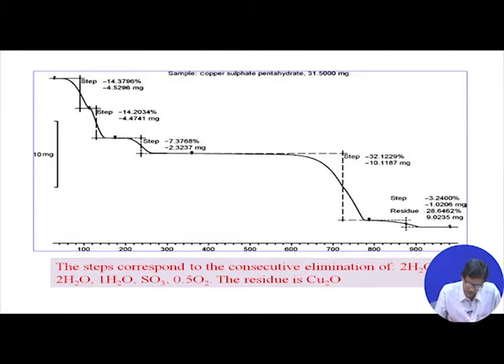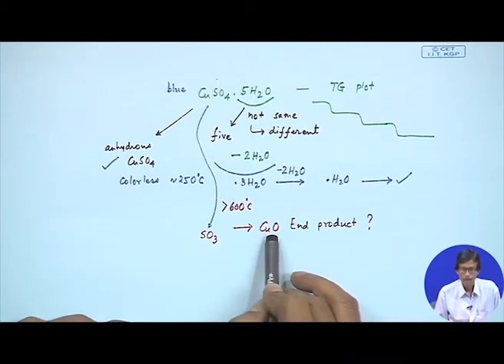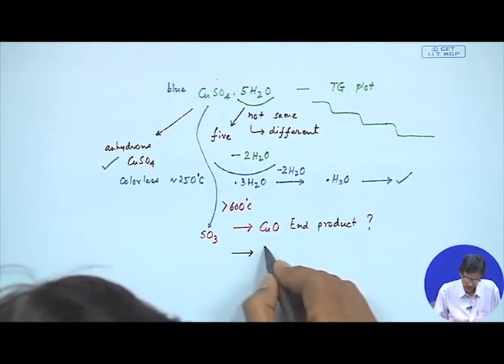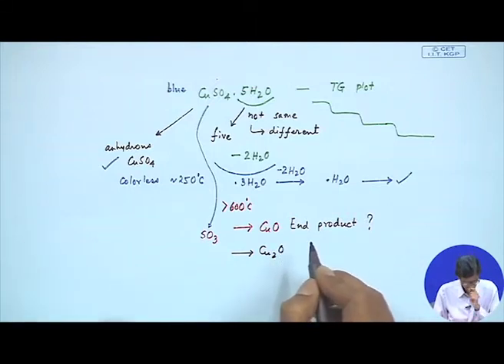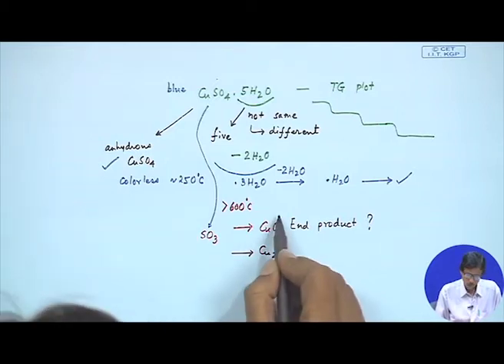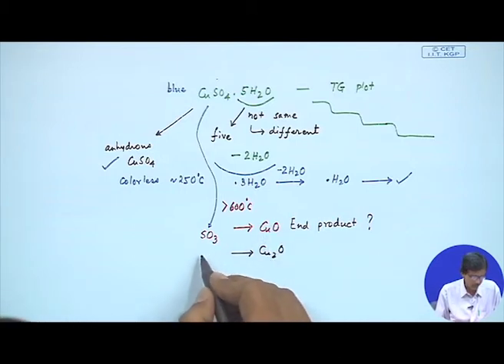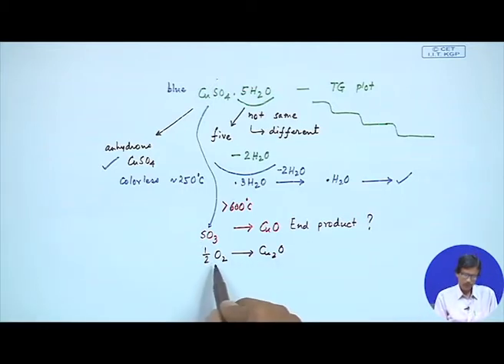So, that 28% weight remaining as residue on the crucible is not due to your CuO, but is due to your Cu2O. That means during this particular heating process, the sample has an inherent tendency to give you the corresponding form as the cuprous oxide, and this Cu2O is basically going through its self-reduction process with the elimination of half of the oxygen.